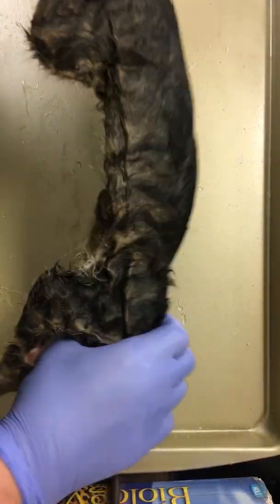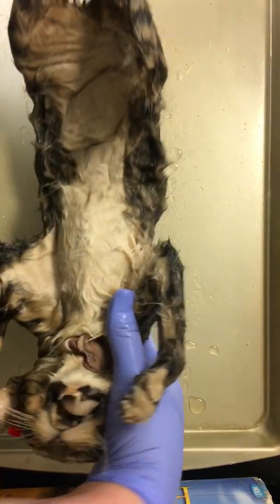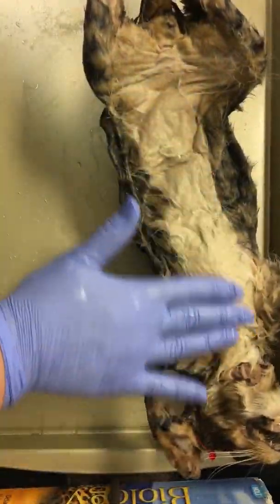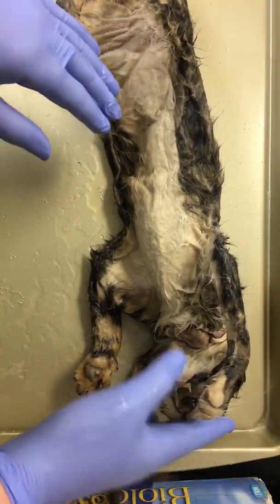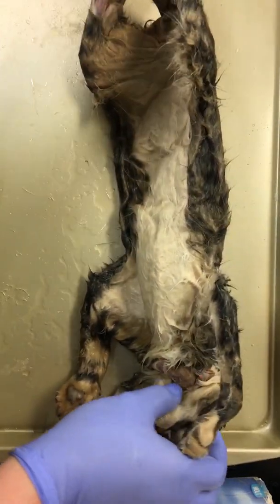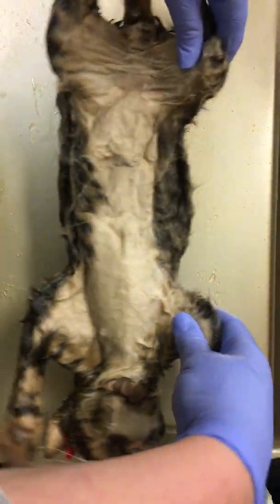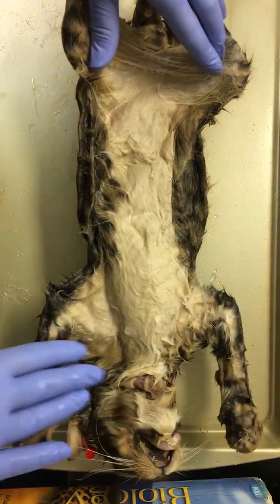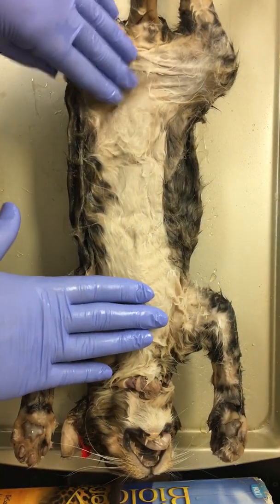The dorsal side is here — this is superior to the ventral side, which is the abdominal side; this would be inferior. We have our anterior portion of our cat and our posterior portion of our cat. When we make our incisions, we want to put this into anatomical position, so it's paw side up and facing down.